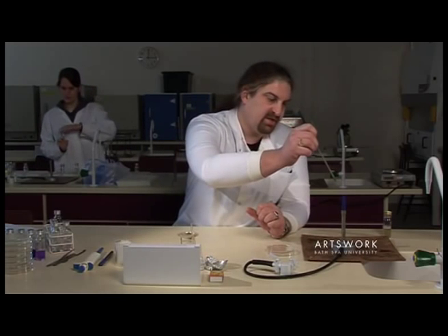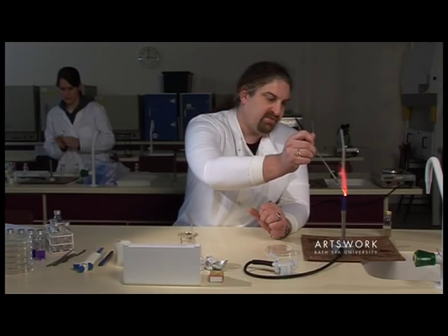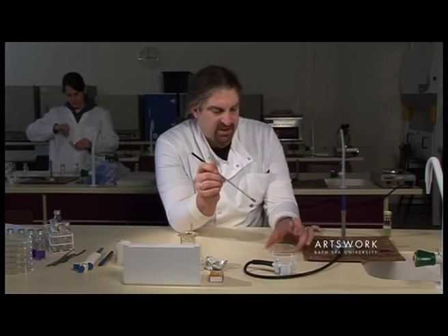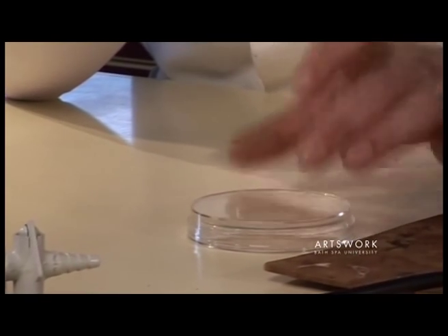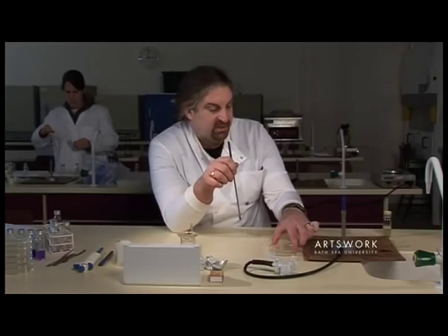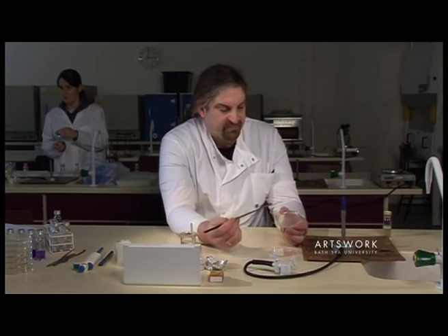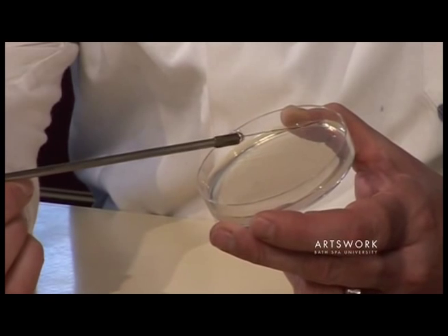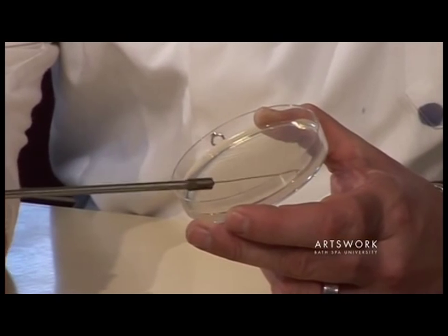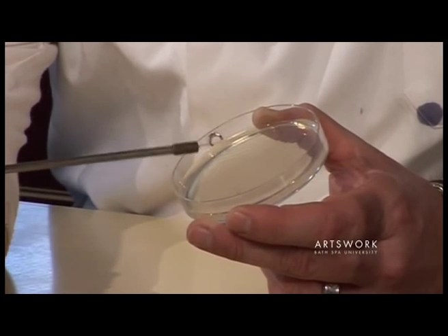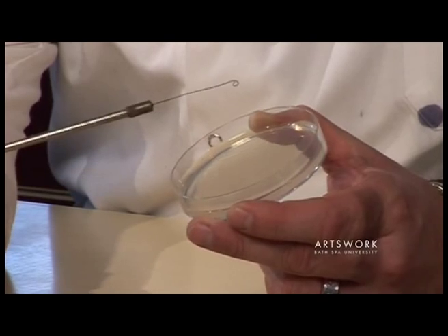Again, flame the loop and turn the agar plate. You can't see the culture, but you'll be able to see the impressions that your loop makes. From the end of your last streaks, make four or five streaks out, down, and across the plate.